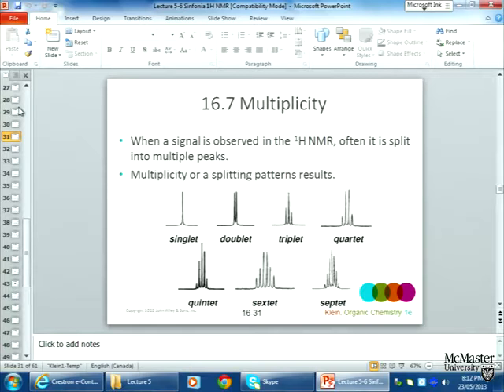methylene protons, a CH2 group which integrated for 2 protons, and a CH3 group that integrated for 3. But you noticed in those spectra that there was not just one single signal for the methyl group, but that it was actually split into 3 signals that had the sort of ratio 1 to 2 to 1. So this sort of signal, this is the methyl group of ethyl benzene, looks something like that.